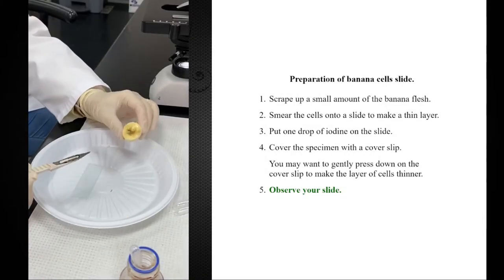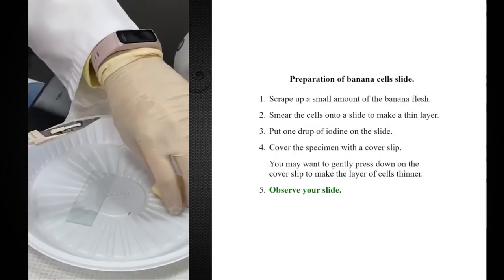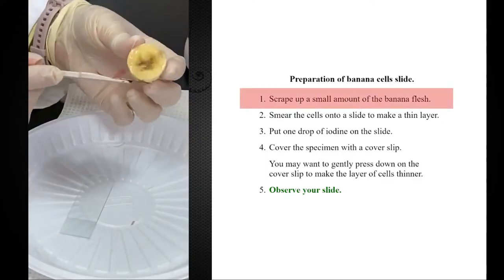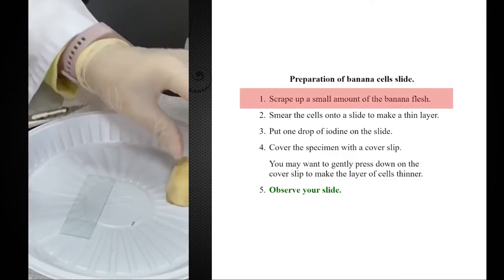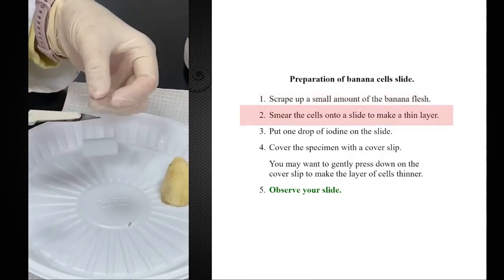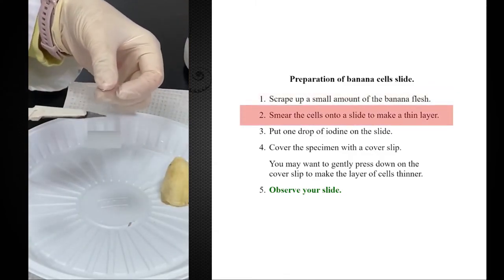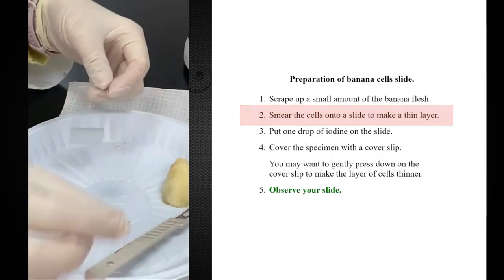Now we'll prepare a slide of banana cells. With the blade, you take a little bit of banana. You don't want to put too much, and you spread them on the slide to distribute them.